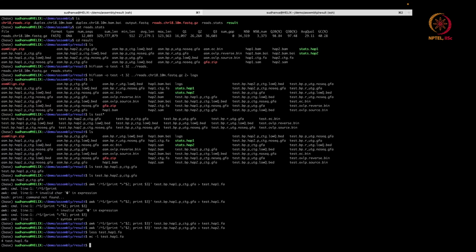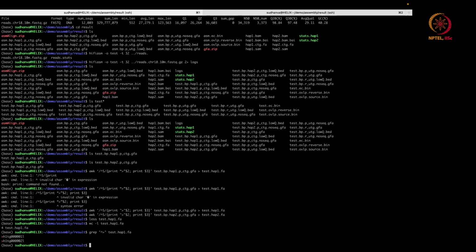Okay, so there are two contigs here labeled H1TG1L and H1TG2L.